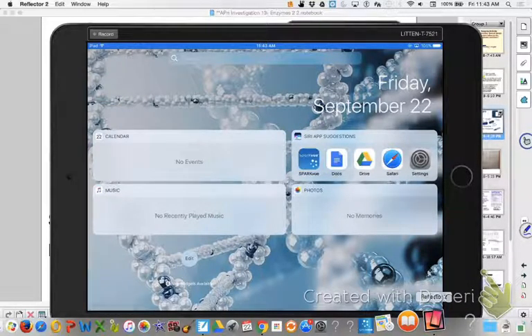But before I even go into SparkView, I need to turn on the Bluetooth and connect to the sensor. So intuitively, where do you think I need to go in order to do that? Into settings, okay?